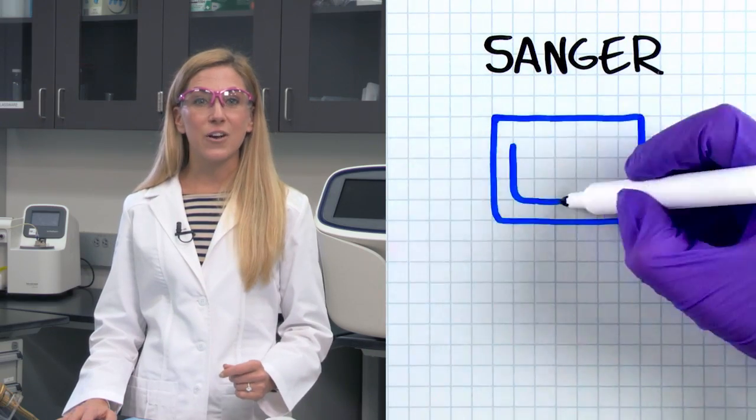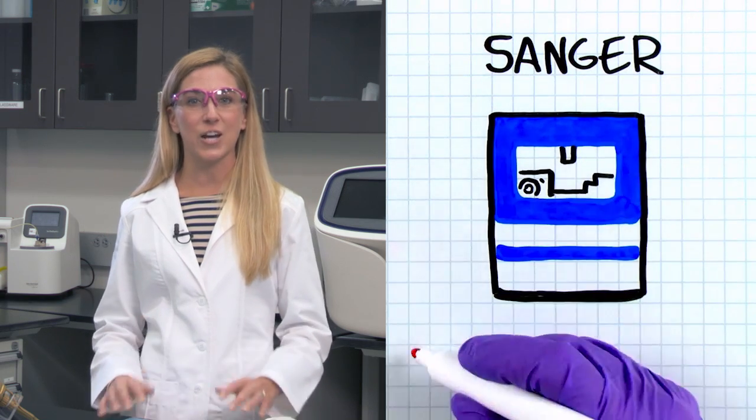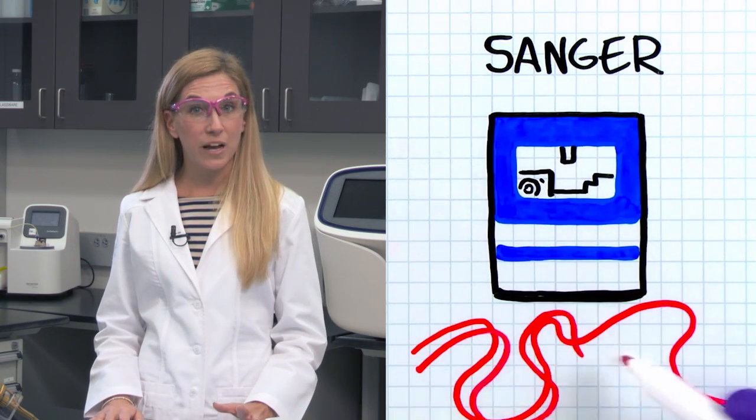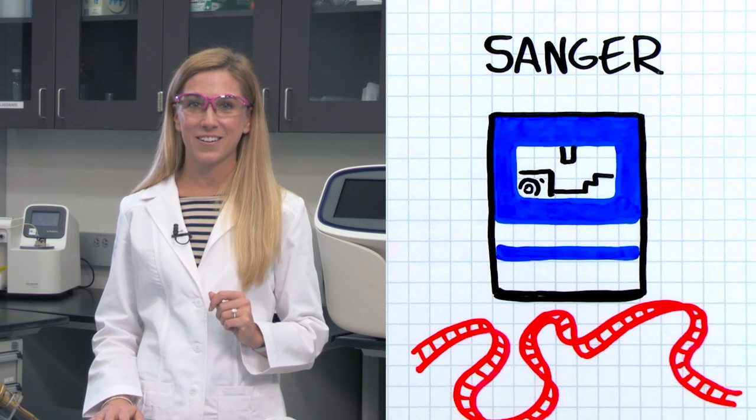So now you understand the reasons to confirm NGS variants. So let's talk about why Sanger sequencing is the best method to use for confirmation. If you've been in the sequencing world for a while, you're probably already familiar with the simple workflow. Sanger sequencing allows you to sequence one single strand at a time with 99.99% accuracy. It is extremely reliable as a verification tool, and it is still considered the gold standard. And for the small amount of samples that require confirmation, Sanger sequencing is the most cost-efficient sequencing method.